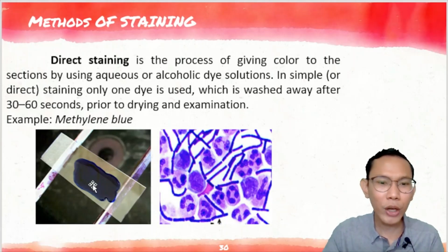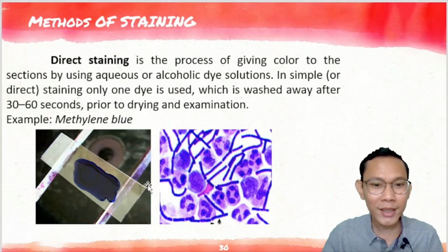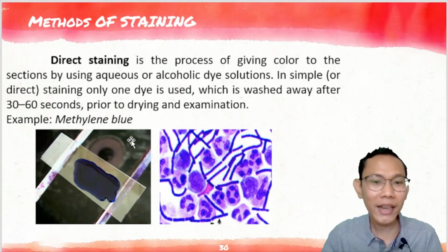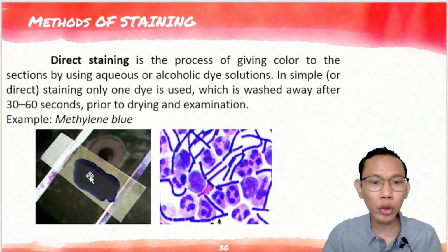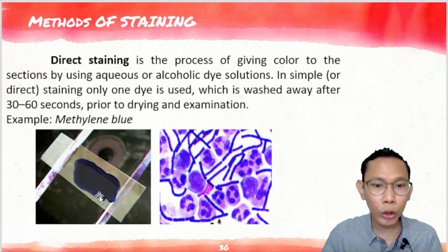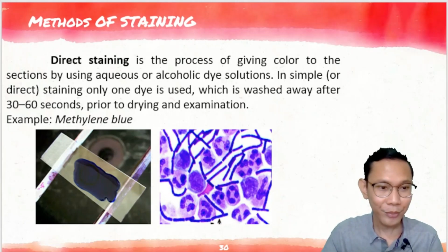So anong ginagawa? Doc, ano po ito? So you will learn this more when you reach your microbiology. But for explaining this, ang ginagawa namin, kukuha kami ng colony ng aming bacteria, tapos ilalagay namin dito. Tapos nilalagyan namin ng NSS para ma-distribute yung bacteria. So pinapadry lang namin dito in heat fix. After heat fixing your sample, nilalagyan na namin ng color blue. Ito na yung tinatawag natin na methylene blue. And with the principle that I said a while ago, ito na yung lumalabas. Your bacilli here, stained color blue. Ano ito? These cells, ano ito? These are your WBC, since these are your bacteria. Okay.